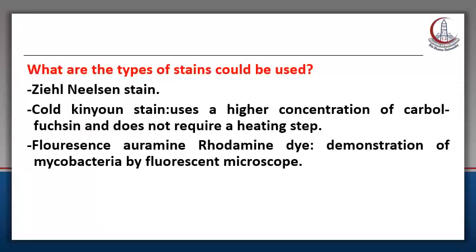Then the next step is decolorization by sulfuric acid. Then the last step is the counterstain with methylene blue.